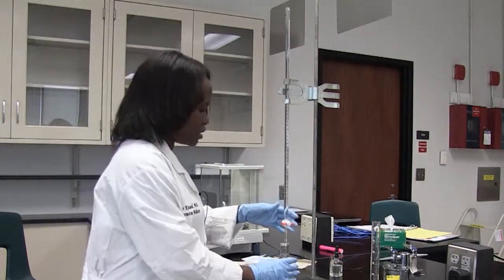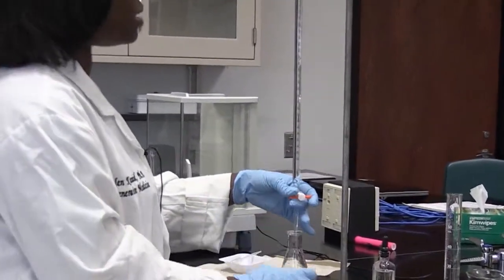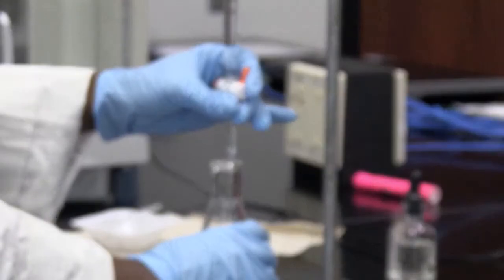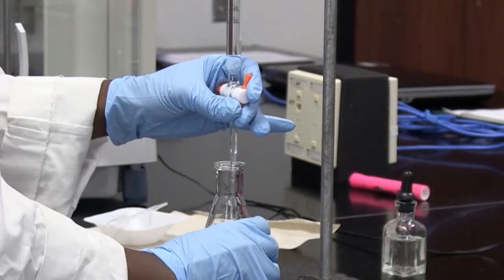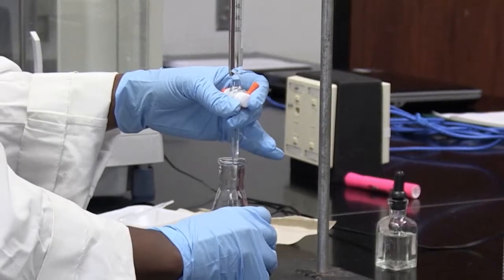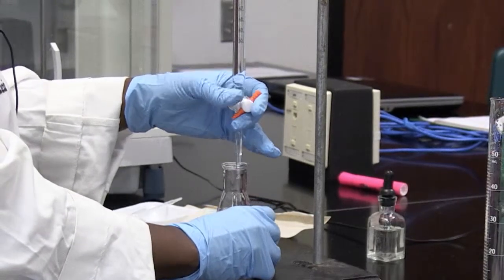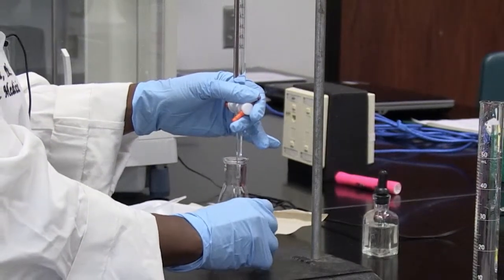I'm going to start. You hold the stopcock in order to regulate the amount of base you're adding to your solution. I'm going to add my base in increments of 1 mil. I turn my stopcock to a slightly vertical position in order for the base to flow in. I add and stop every time I get to a mil downwards, then swirl the flask to make sure the two substances are mixing together so they can react with each other.